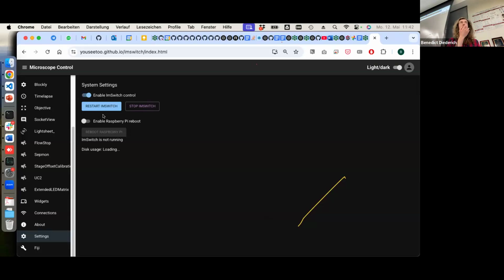And would it then also remount the hardware? Because I figured that when you disconnect the hardware, it won't recognize it again. We would have to test that out. It depends on how the hardware gets used, like the mount or the kernel or whatever. Yeah, that would be very helpful. Basically, you should not need to do Docker compose commands.